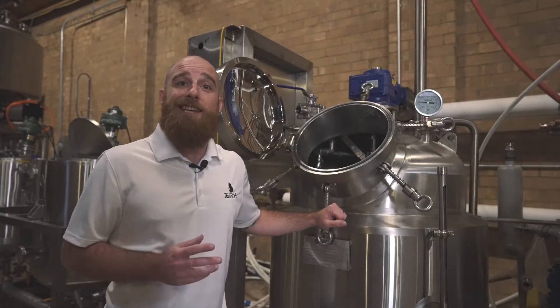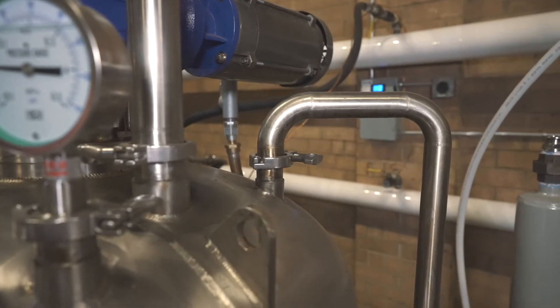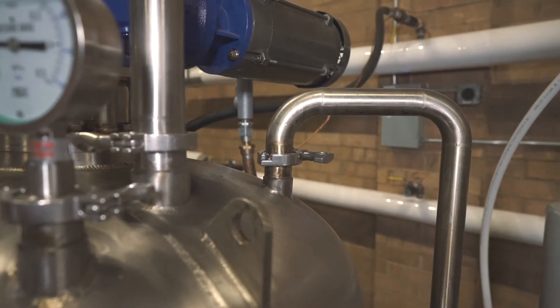The evaporator jacket is heated using low-pressure steam provided by the boiler, and the temperature is controlled by the steam control valve and set and maintained using the Siemens PLC.